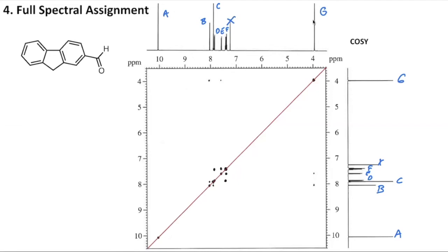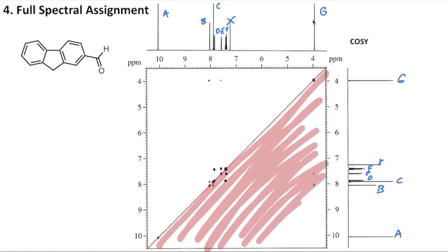This one will be another where I draw a lot of lines and then try to just fill in the cross peaks and get rid of the lines because they're just a lot to look at. So to get started, I'm going to read the top half of the graph and work down and then across to the opposite side. So we're going to kind of cut through some of these other peaks. It may get a little bit confusing, but if it helps you to just think that we don't care about any of the peaks that are in this bottom half of our graph, just ignore them completely. That may help simplify a little bit of the massive amount of data that we're going to look at.